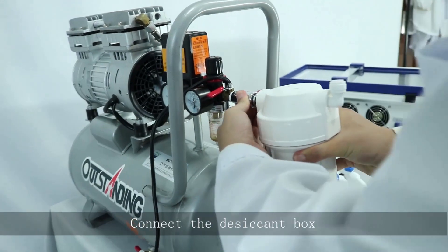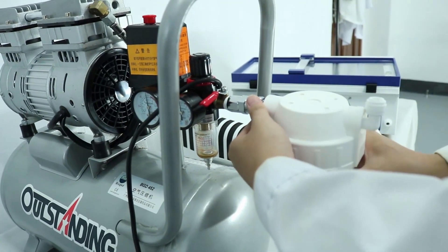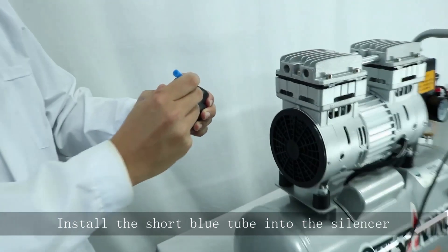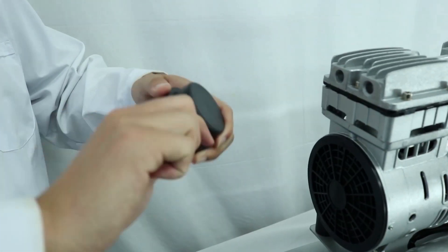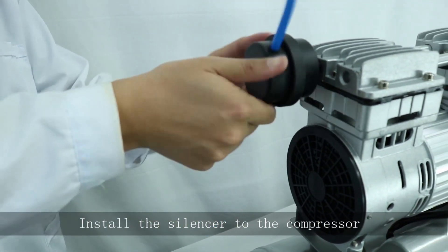Connect the desiccant box. Install the short glue tube into the silencer, then install the silencer to the compressor.